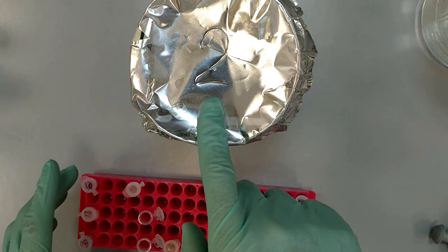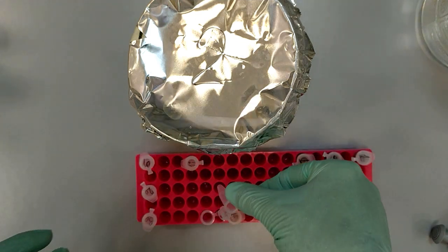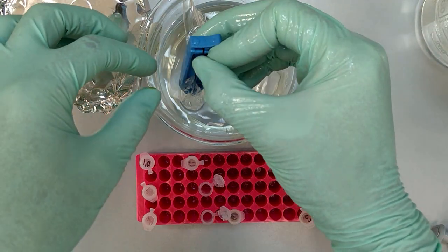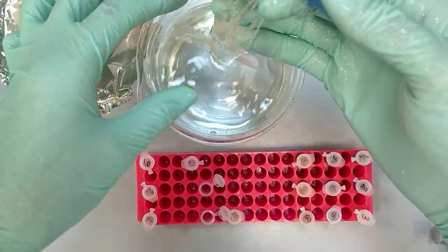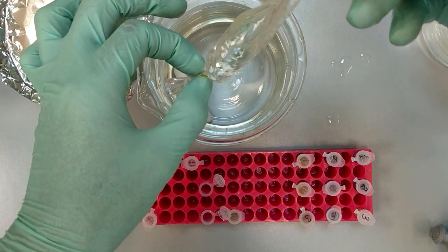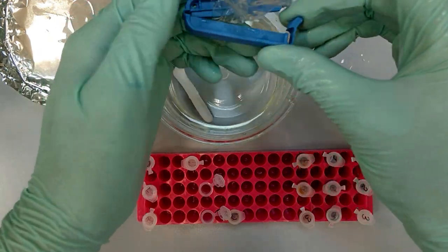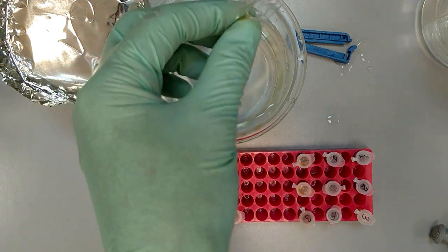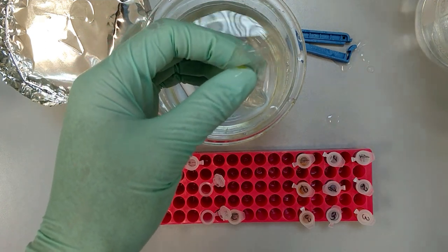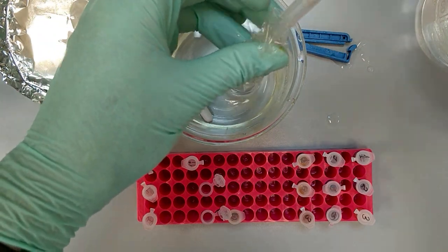So now we have the second secret solution and the Eppendorf indicating the insides of the second secret solution. So as you can see, it became a little more in terms of volume. So we open the clipper and transfer the inside to the appropriate Eppendorf tube.